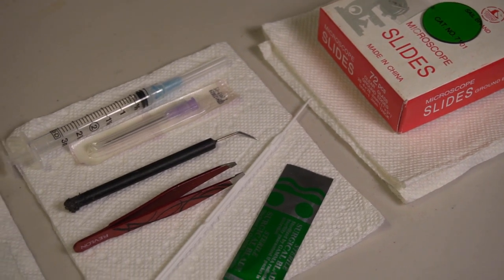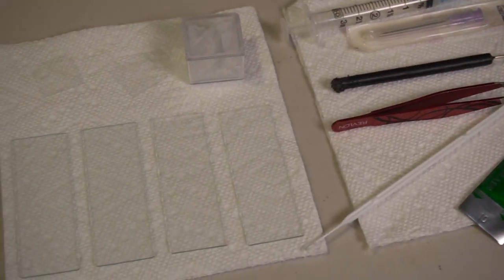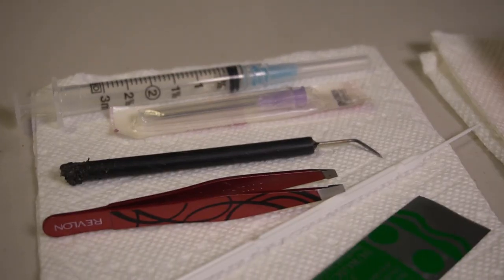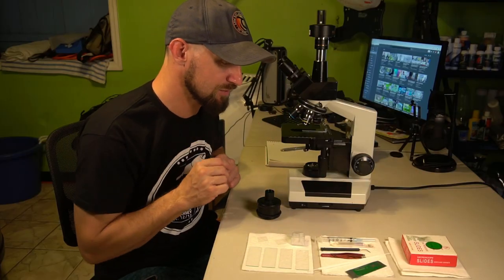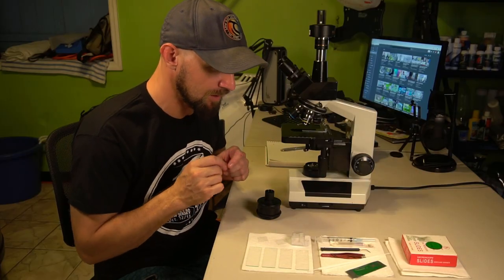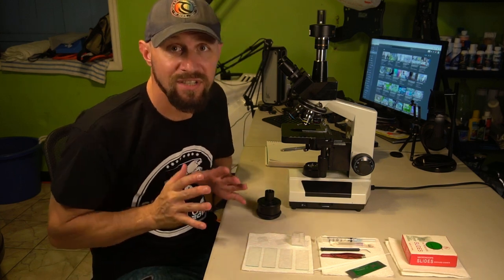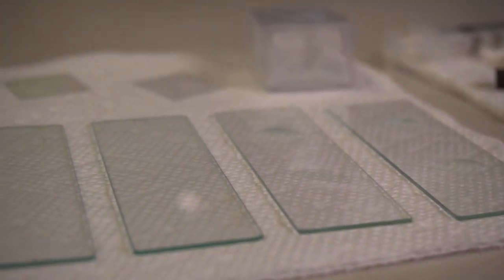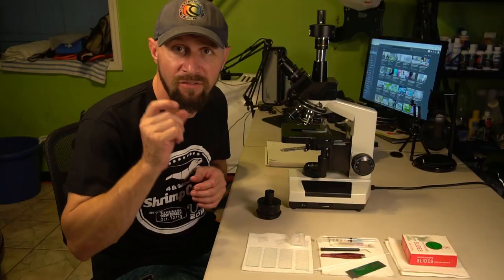I do not have a dissection kit right now, so I had to get a little creative and make my own DIY dissection kit. I have a sterile surgical blade, an inoculation loop, some tweezers, a little poker, and some hypodermic needles that can be used for scraping, poking around, and moving specimens to a slide. I have four slides here ready to go — two of them are indented so that you can put something larger on without it getting smashed by the cover slip.